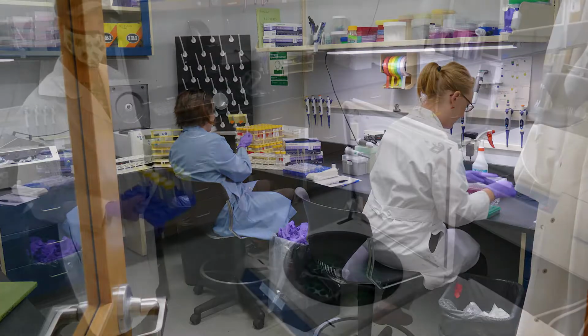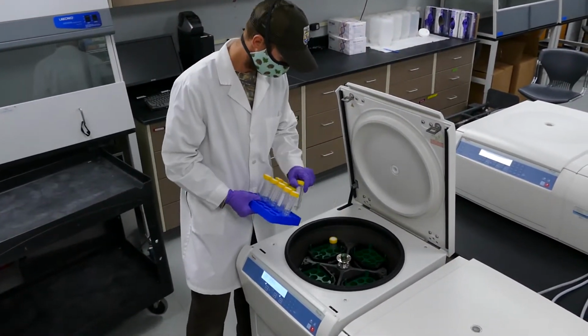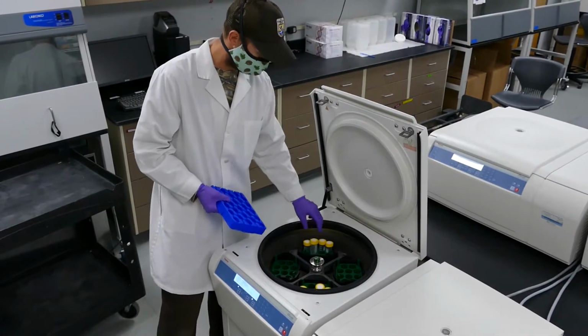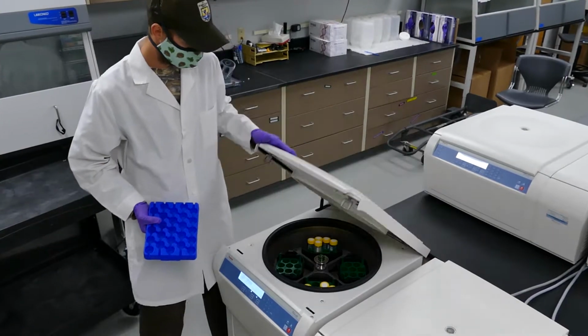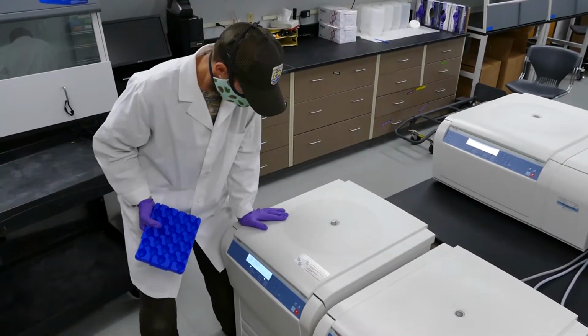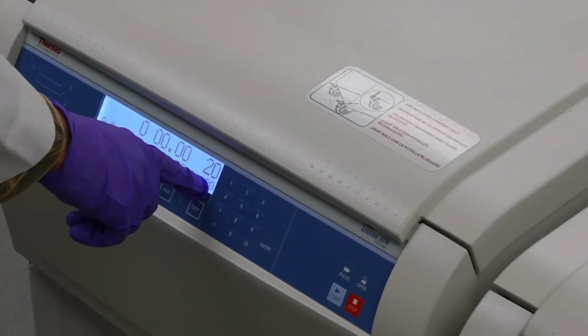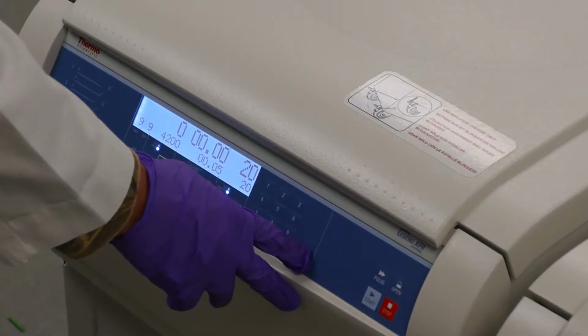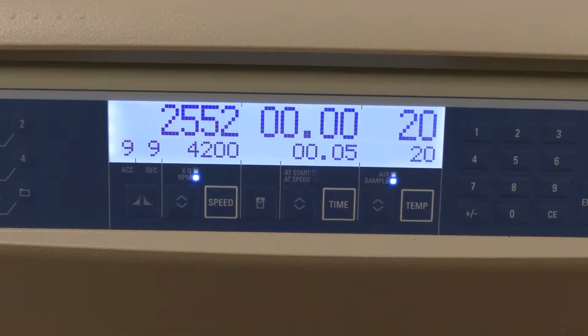Upon receipt of the samples, each tube should be inspected and gently swirled if any debris from the pellet broke loose. Each tube should then be placed in the centrifuge, making sure to keep the centrifuge properly balanced, and centrifuged at max speed for 5 minutes. You'll notice that our max speed is 4200 RPMs. These speeds may differ from machine to machine.